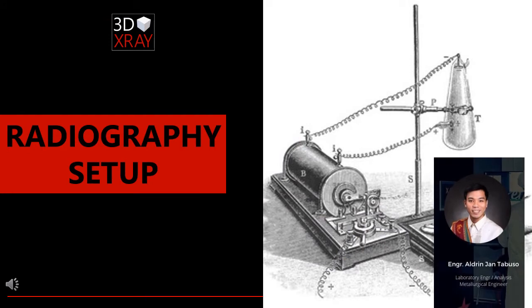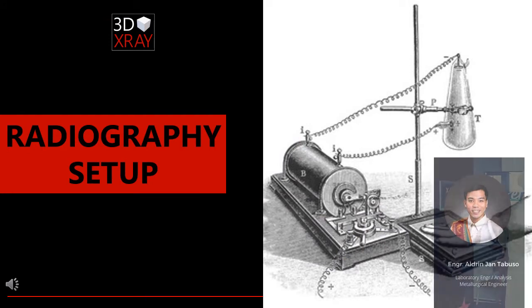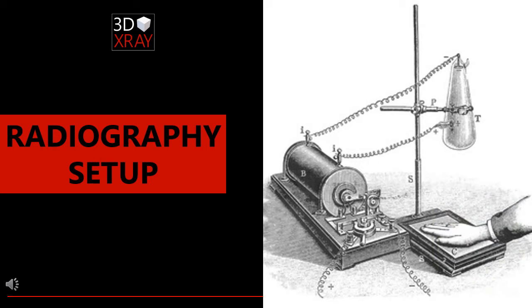Now, we will be talking about a common setup used for radiography. As you can see in the image, this is the first ever radiography setup made by Wilhelm Röntgen, which is referred to as the Röntgenogram.